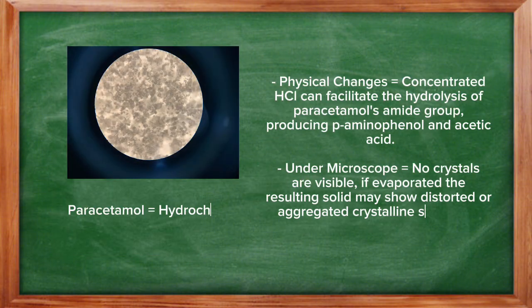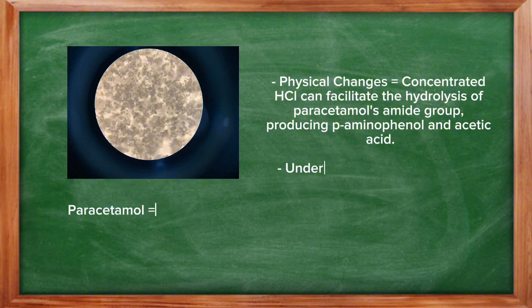In physical changes, concentrated HCl can facilitate the hydrolysis of paracetamol's amide group, producing p-aminophenol and acetic acid. Under the microscope, no crystals are visible. If evaporated, the resulting solid may show distorted or aggregated crystalline structures with pitted surfaces.